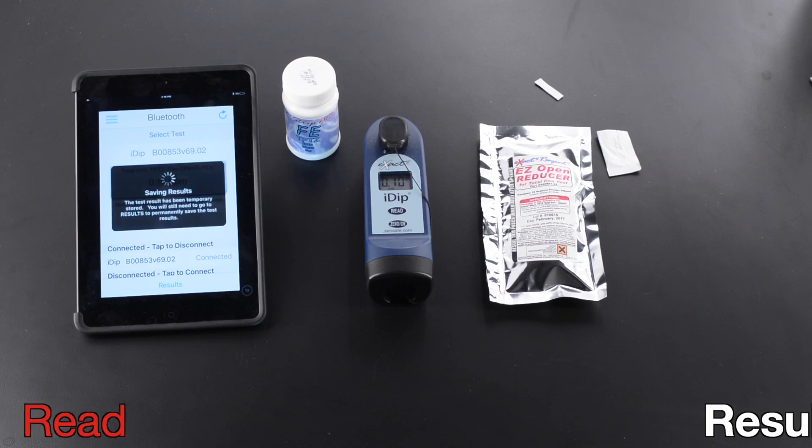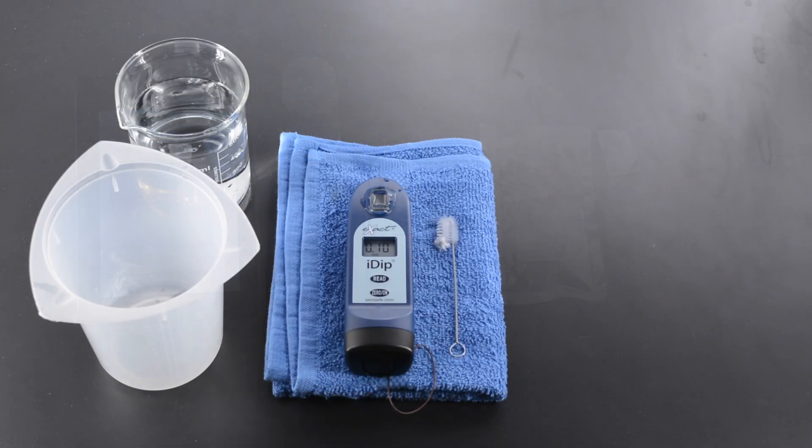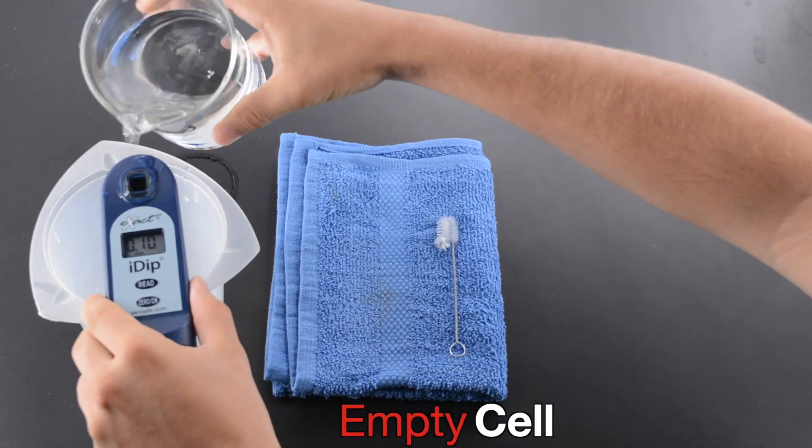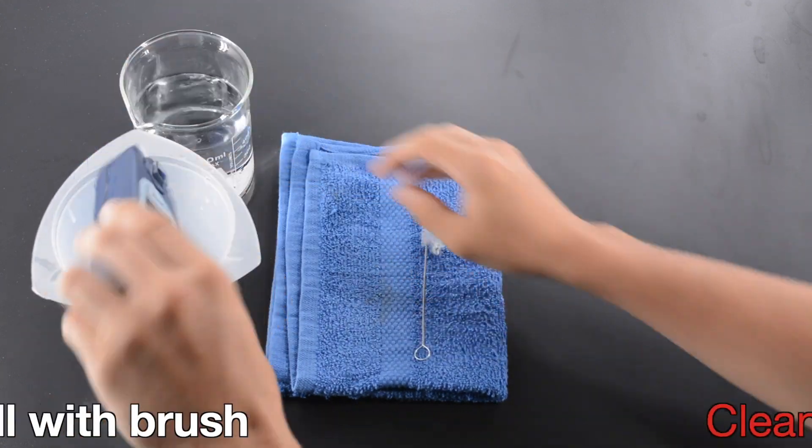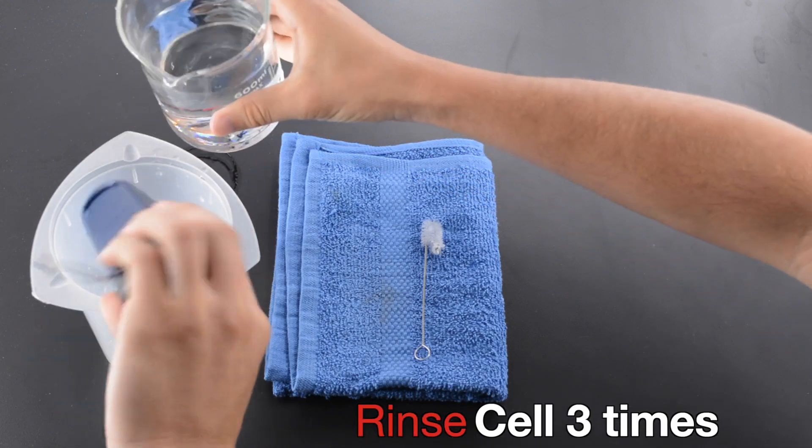Rinse. Read result. Empty cell. Clean cell with brush. Rinse cell three times.